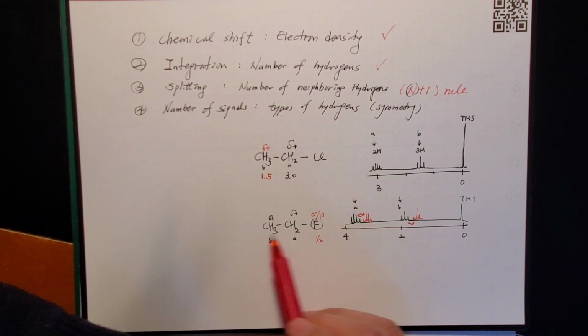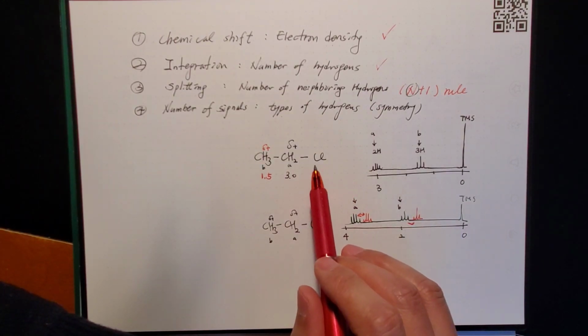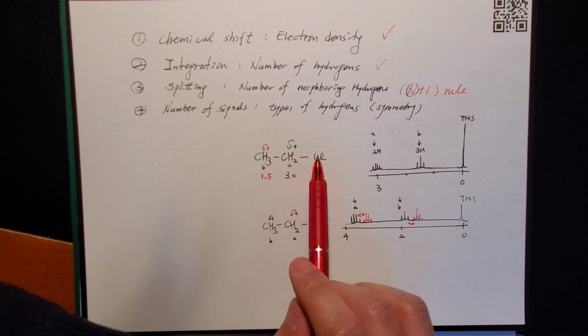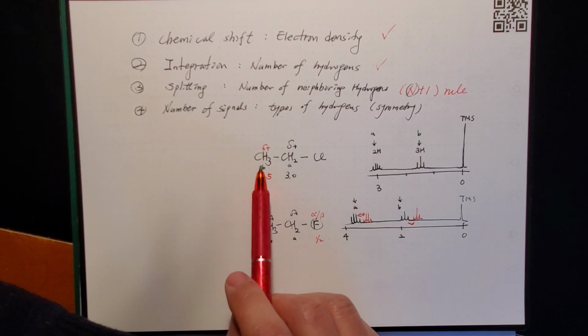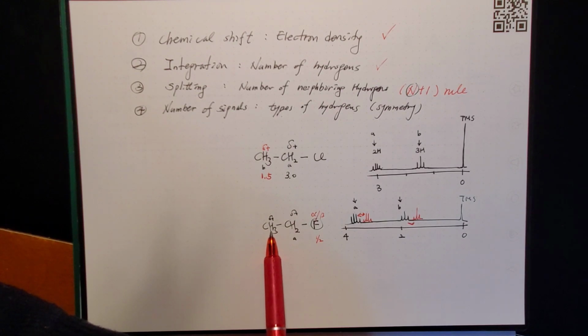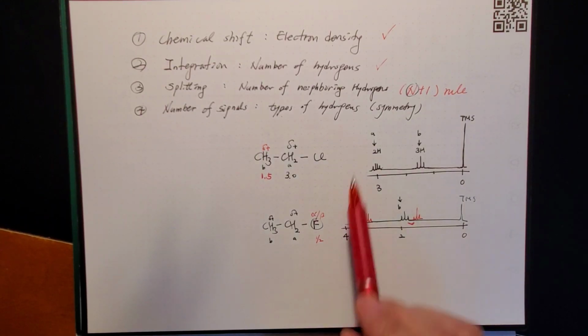Okay, normally this value comes around 1 point something, not quite 2. Okay, 1.2 or something. But for the chlorine, the beta hydrogens are more influenced by chlorine, losing more electron. So although this has a lower electronegativity, the beta hydrogen on this molecule seems to be more de-shielded than the one near the fluorine. Okay, this has to do with the molecular orbital, but for non-majors, you don't need to worry about this. I think this is enough.